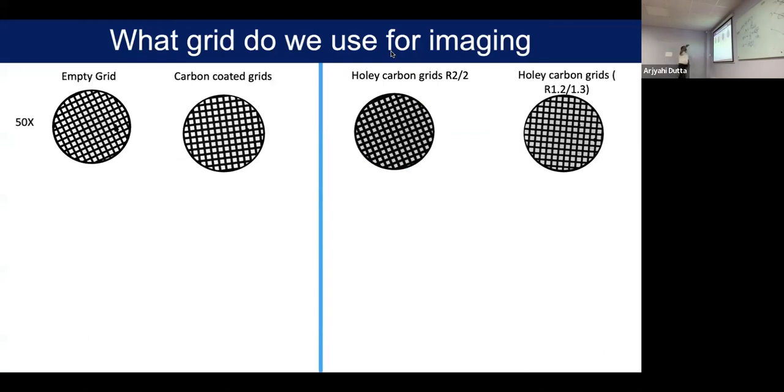So here you can see how we can use this electron microscope. Now probably you guys will be a little bit happy that I am constantly talking about the magnetic lens. So how we can prepare our sample: there are different types of grids available, but in most cases the grid diameter is 3.05 millimeter. Now, there are two types of microscope we can use nowadays.